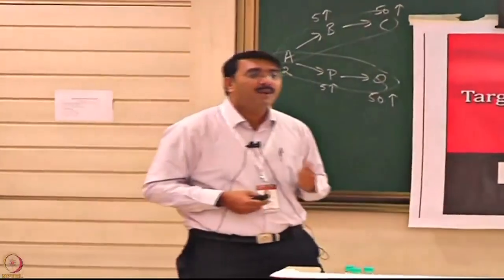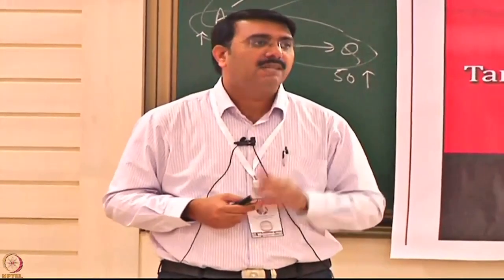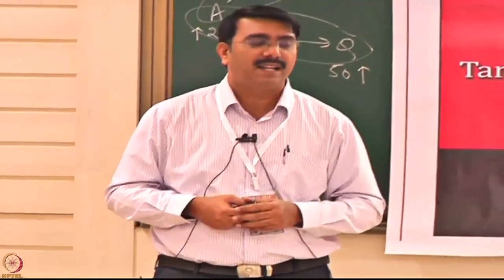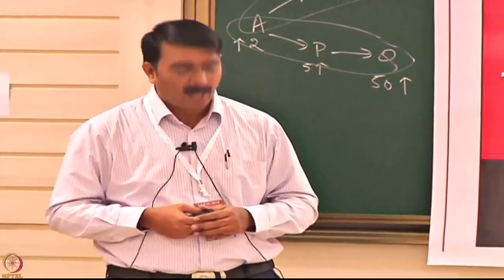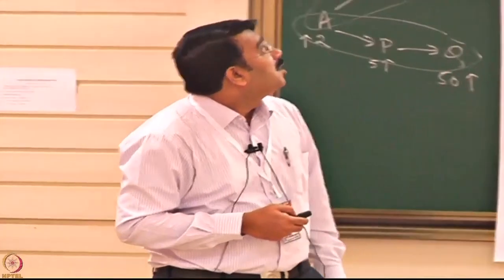But it will not provide you the kinetics parameters, like on rates and off rates. This is the limitation with the ELISA or the ITC-based technologies.